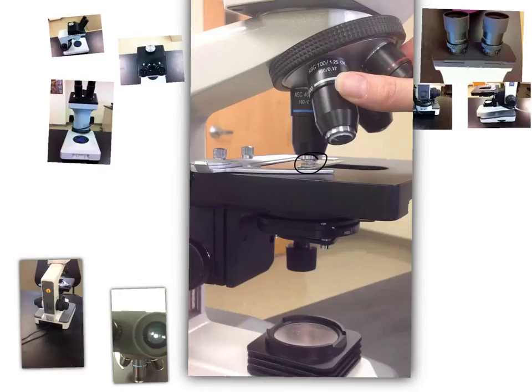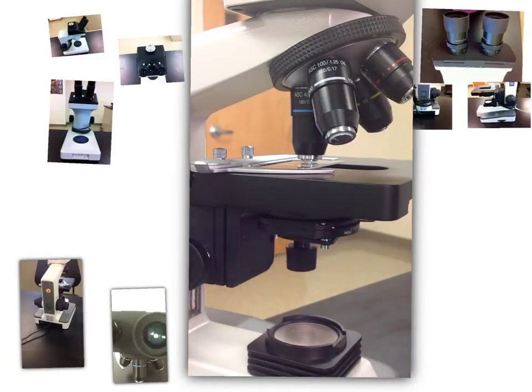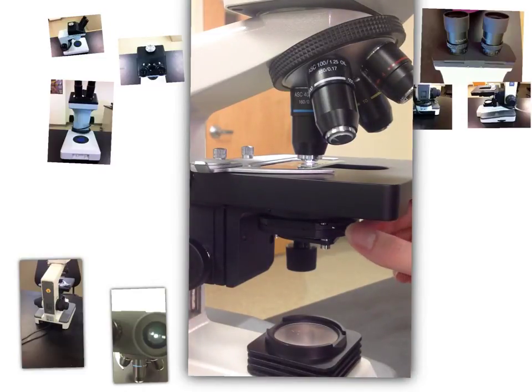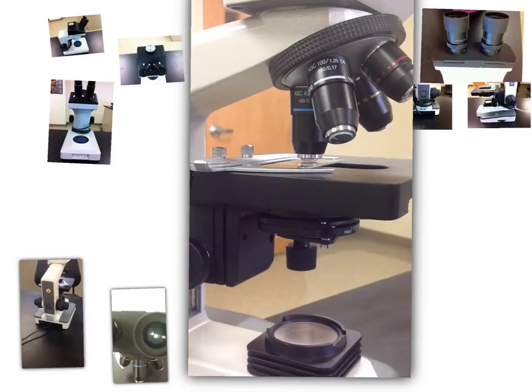Let's just make sure that that is completed. And you're just going to move it a very tiny amount with your fine adjustment, just to make sure that you're nice and focused. Now if we take a look, I'm letting in some more light, as you see there. Did you guys see that? So I let in some light, and then I decrease the amount of light, so that depending on whether or not my organism is opaque or not. So I'm playing with the iris, the condenser. And I'm playing with the light at the bottom, just to give it that maximum amount of light. And that is how you focus in on the slide.